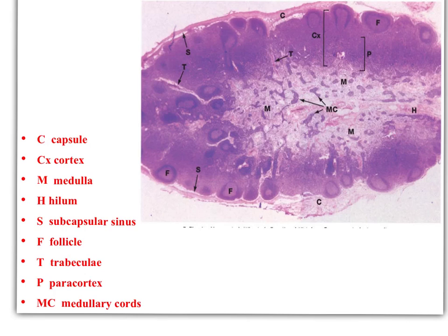It is the medulla. Here you can see at this center of the lymph node, this is the hilum. This hilum contains here the blood vessels, all types of blood vessels, arteries and veins, together with the efferent lymphatics. The afferent lymphatic comes here and passes through the sinuses, either in the subcapsular sinus or trabecular sinus, to be filtered, and then passes to the medullary sinuses, and then collects in the efferent lymphatic to pass away from the hilum.